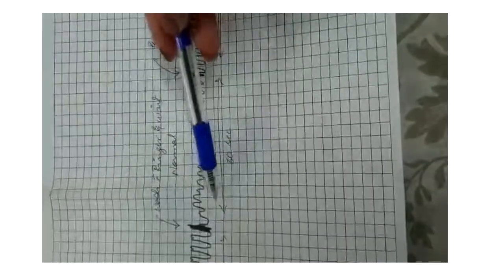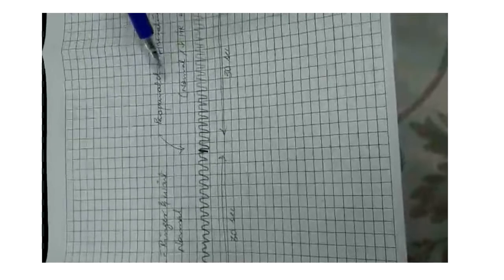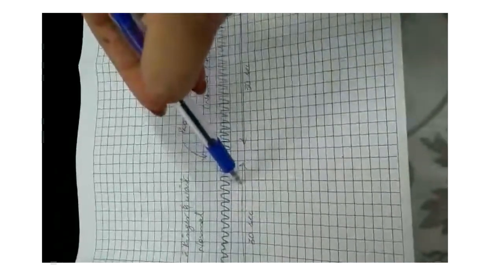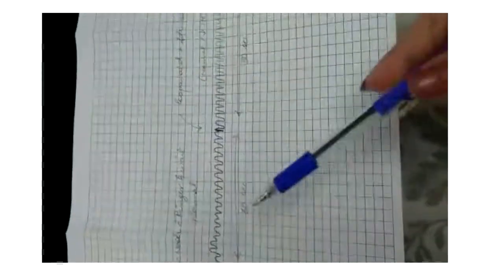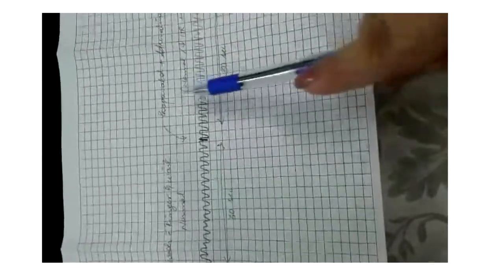Now after washing with ringer and waiting for some time, we took normal reading again for 30 seconds, and then this is the key point. When we assume that unknown drug is adrenaline, we took the blocker or antagonist propranolol and added unknown drug with it without washing. Now you will compare this reading with this normal reading. So you see that there is no effect of adrenaline here like here. That means the propranolol has blocked the receptors.